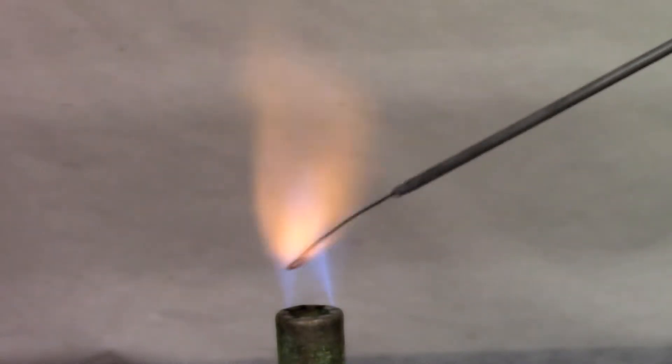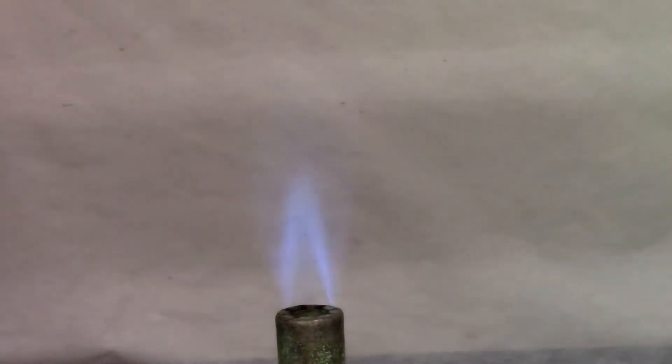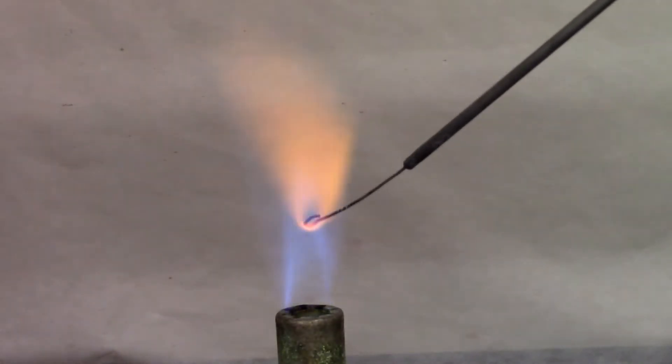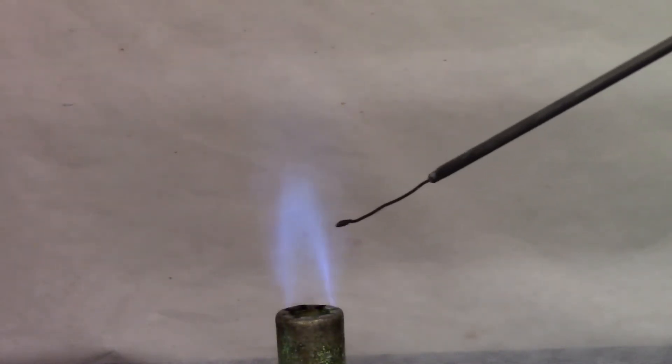So that was barium. Now I'm going to burn it off for a few seconds and then it will be ready for our next solution. Now I'm going to use our calcium solution. You're looking for a red flame before the orange flame shows up.